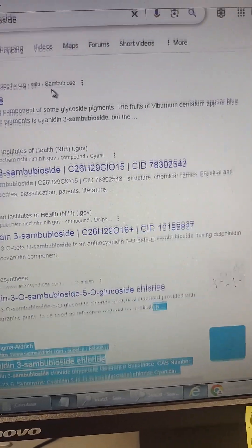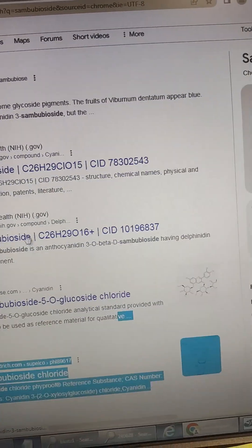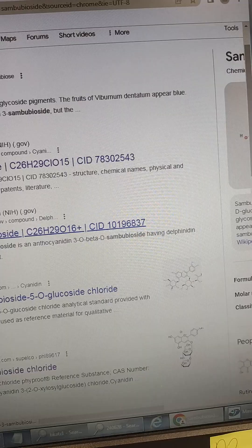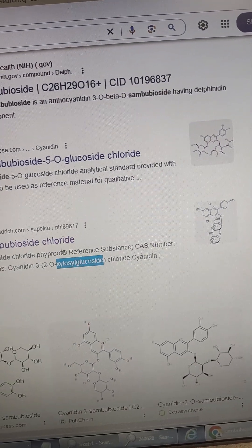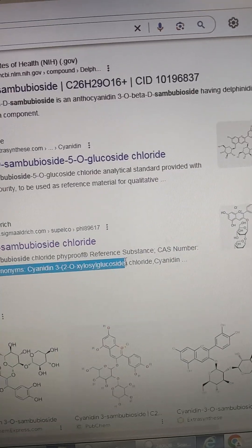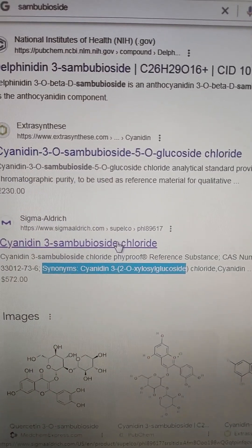Sambubioside, if you search that is, right? You can look on here. That is the xylo. So the synonym, that's the xyloglucoside. So it's just the sugar acid. The sugar conjugates have all sorts of different names.